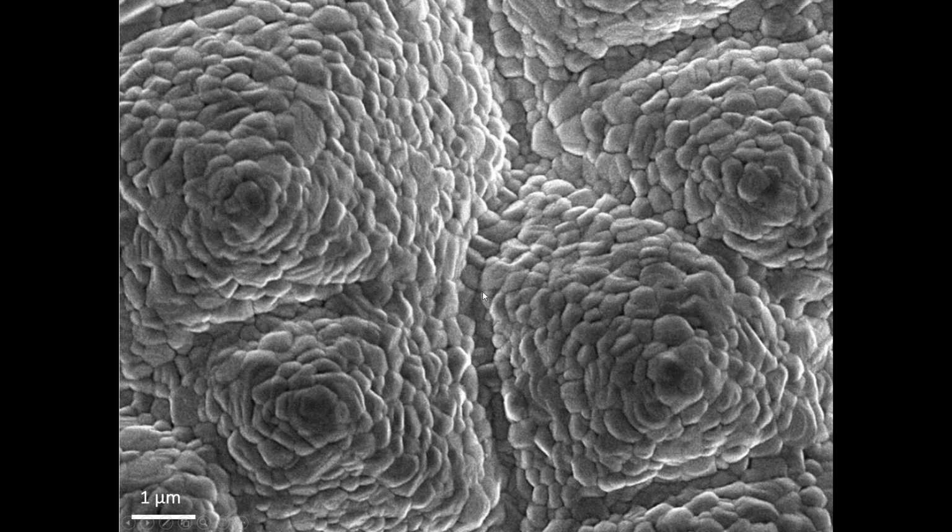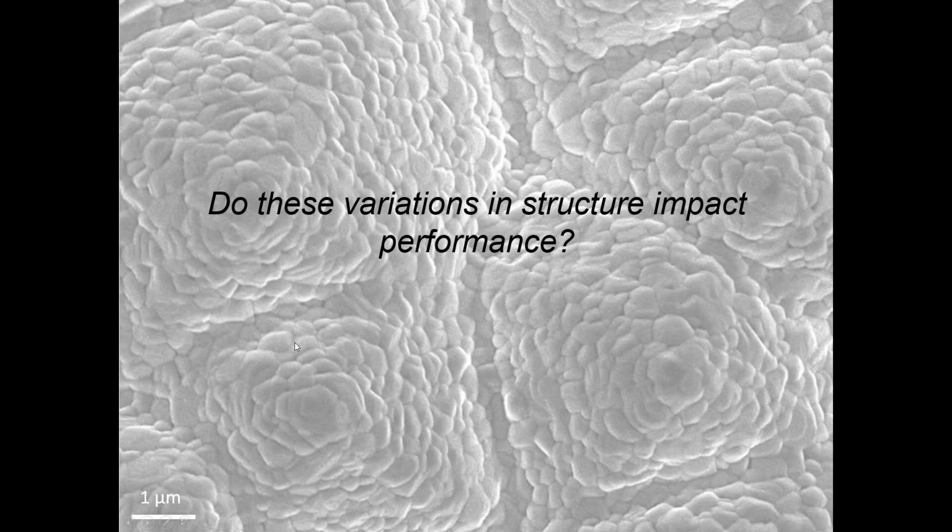Now, silicon is actually a quite smooth material, but when we place perovskites on, we get this grainy texture, and that's what the perovskite is. It's grainy at the microscale, made up of grains. And this causes quite a lot of heterogeneity or non-uniformity within the topography, which is what the surface looks like. But my question is, and I think this is why microscopy can help answer it, do these variations in structure impact the performance at all?